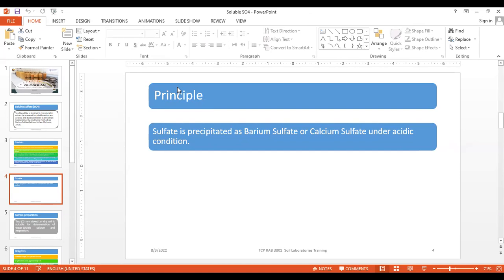But I got a note from Maria that you use a spectrometric method, and rather than weighing the precipitate, you put the solution into the spectrometer and use a standard solution at the end. And this is also correct.